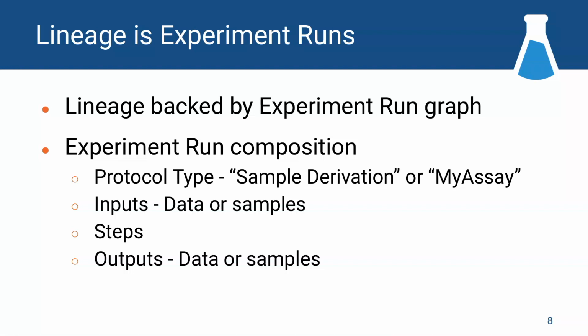It's not a file though, and it is used as an input into the run. There's a series of steps. Typically, like for sample derivation, there's one step. For assays, there's one step, but there are some more complicated processes that you can capture within LabKey that have multiple steps, right? The MS2 runs, you could do fractionation, you can do pooling, and you can describe all of this within LabKey Server. And we don't expose a lot of that in the user interface, but just so you know that it is possible to capture that kind of information.